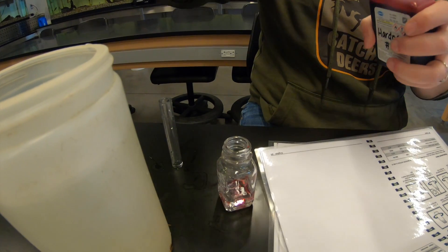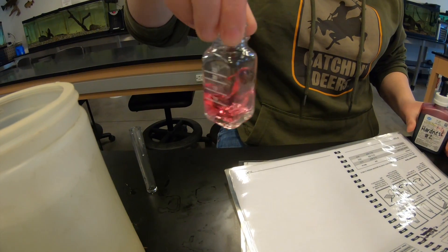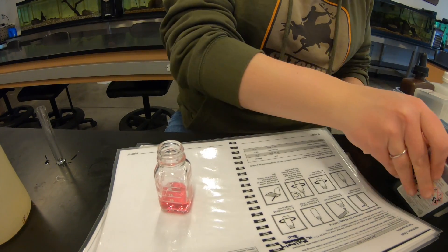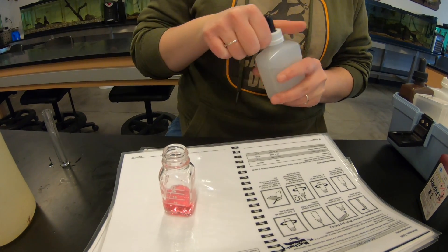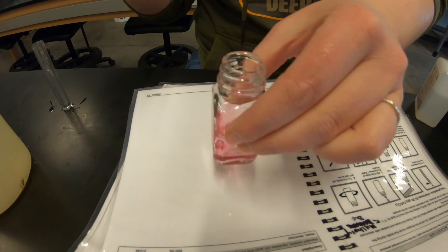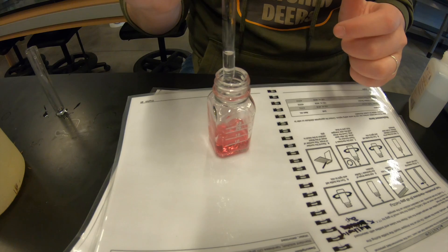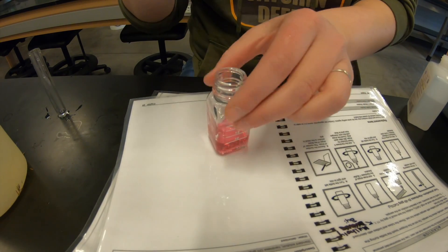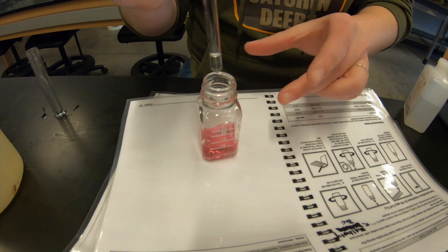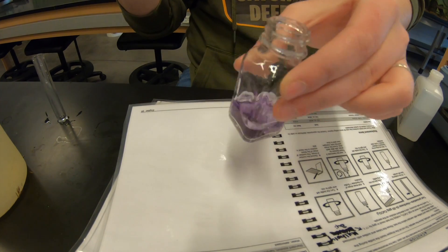Next, add one drop of hardness 2 indicator - a pink color will develop. One complete drop, mix that around - we have that pink color now. Then add the hardness 3 titrant drop by drop, counting until the color changes, just like the alkalinity test. Adding drops one through eight with no change, and at drop nine we get our color change. Nine drops total.